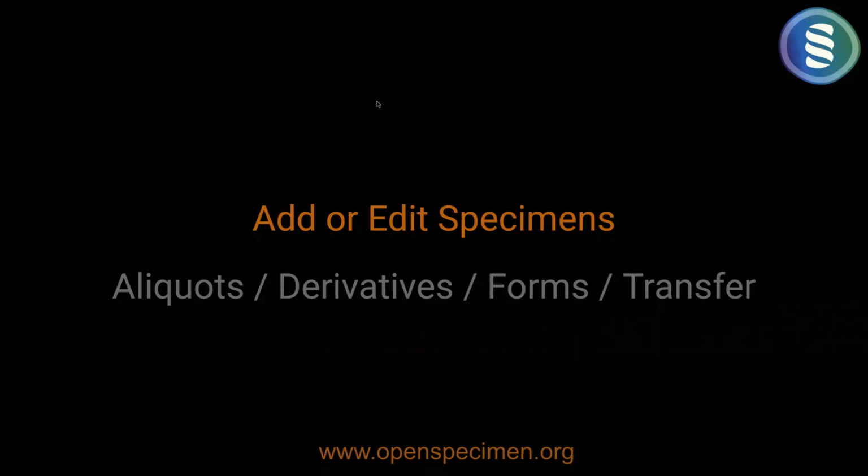So you can create aliquots, derivatives, etc., and some of these things are not yet implemented, like transferring. But again, the goal is that you scan, and then say, okay, I want to transfer these specimens, or you want to retrieve these specimens out of the freezer, check out, check in, those kinds of things. So all this, again, the whole goal is to make anything that is lab oriented, or things that the users do standing or while they're moving, more convenient for the users.